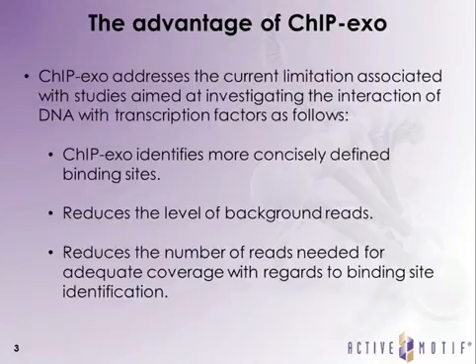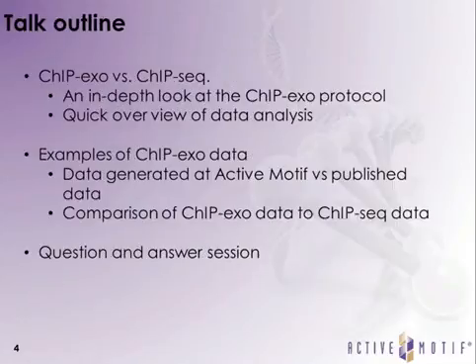So this talk will cover ChIP-Exo as it relates to ChIP-Seq historically, with a more in-depth look at the ChIP-Exo protocol to give you a better understanding of just what's happening in the ChIP-Exo reactions. And there will then be a quick overview of data analysis at the end of that section.